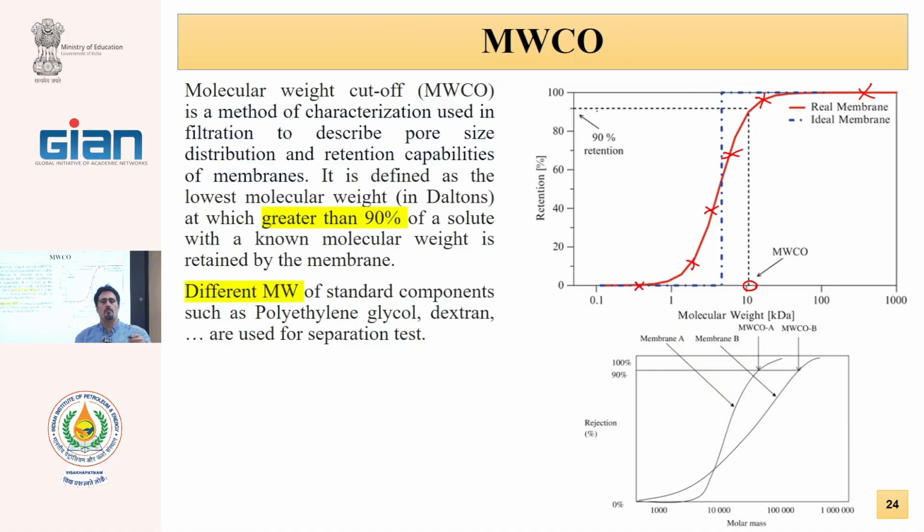If we go to the commercial membrane sites, you see that there are maybe 20 ultrafiltration membranes with different molecular weight cutoff.